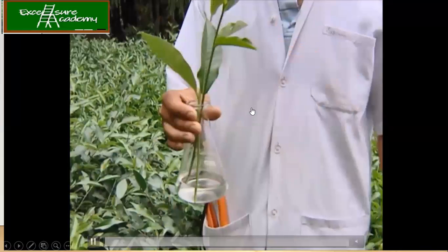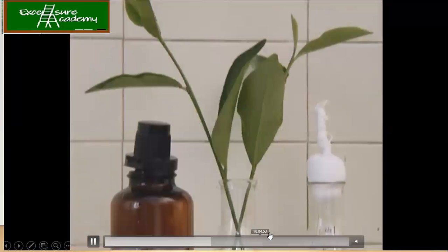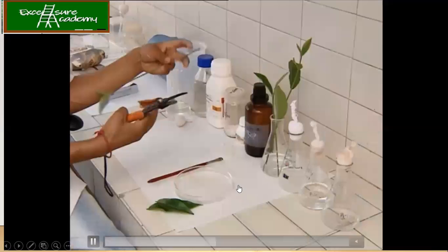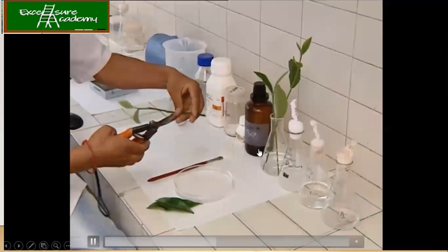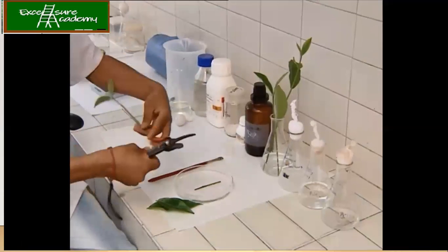Now, this is how you harvest the plant so that you can make the explants later. You keep it in the sterilized water, and then with the help of scissors, you make small pieces so that you can transfer them to the culture media.